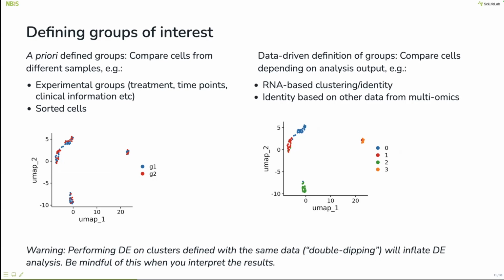And then when we do differential expression, we say, oh, T cells have this gene, whereas B cells have this gene. But that might not be the case. It might be that they've clustered based on something else, based on this gene, and that it doesn't really have the same biological relevance. It also has to do with what population are you actually testing when you do this, if it's reasonable to, or how to classify that population truly.